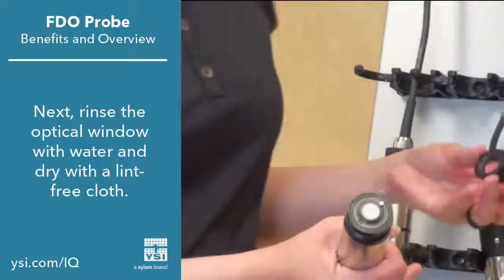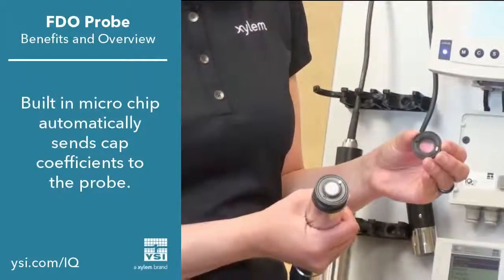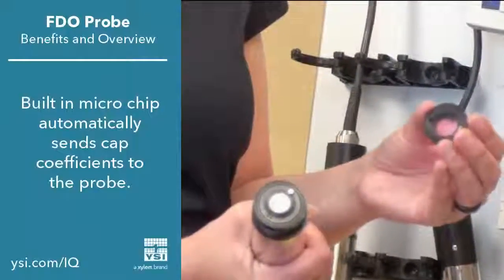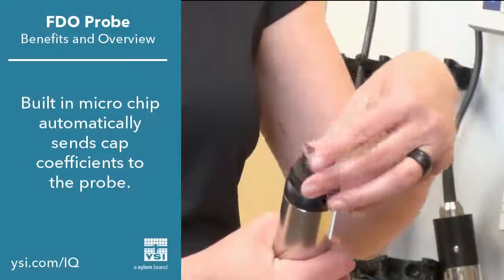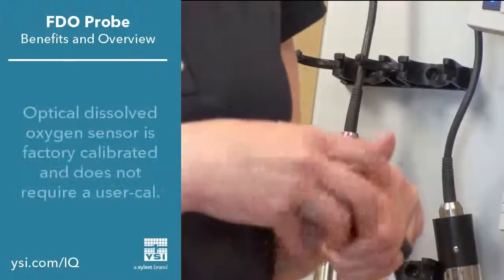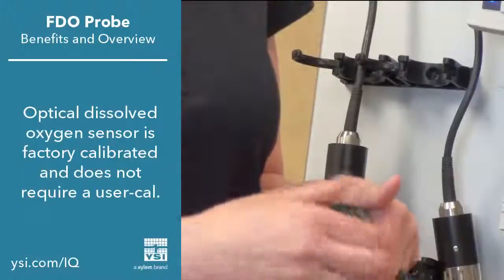You can see the sensor caps have a chip built into them. These are preloaded at the factory with calibration constants specific to this cap's dye and paint layer. By aligning the sensor, those coefficients are automatically sent to the probe, so there's no need to re-enter the calibration coefficients for your optical oxygen probe on the iQ SensorNet system.